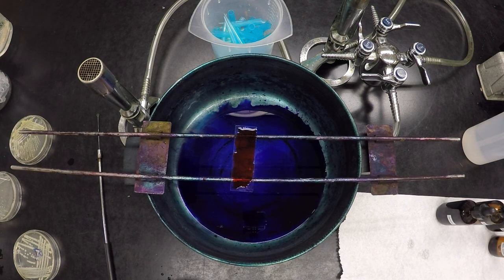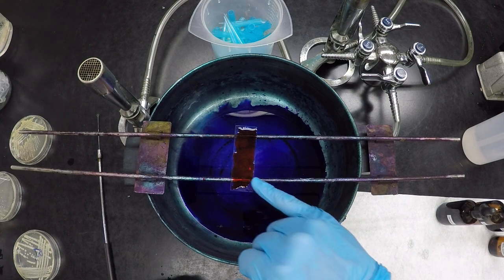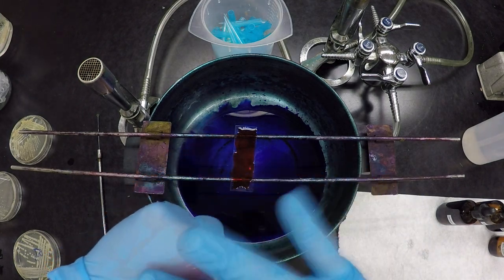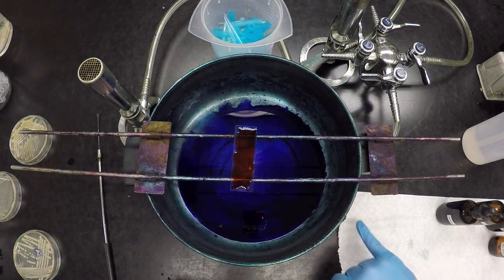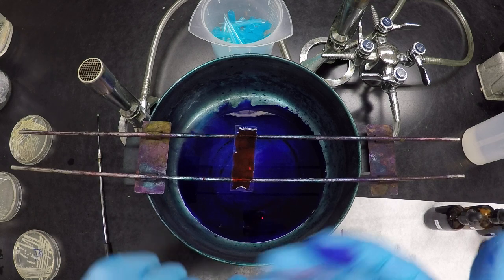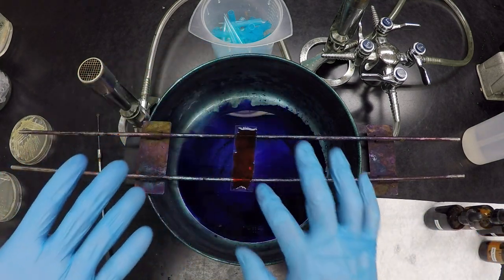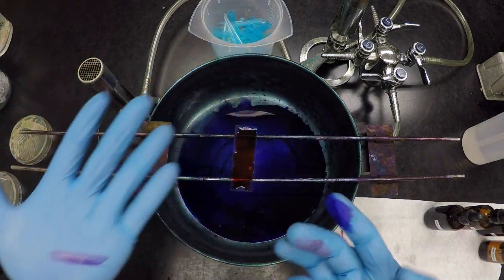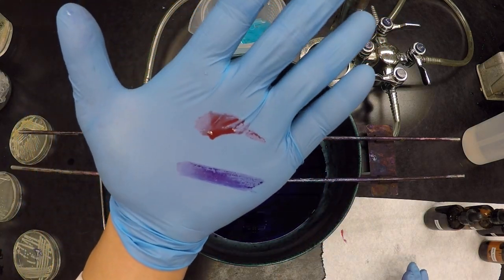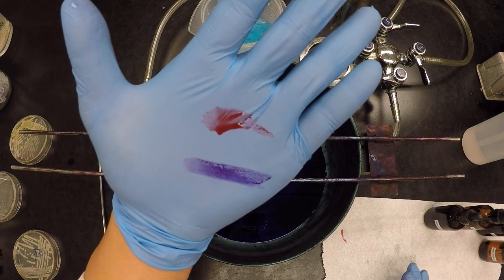It will color the gram-positive cells as well, but because the gram-positive cells have that very dark purple, you're not going to see the safranin. But our gram-negative cells have been decolorized. They're now going to end up in this nice pinkish red color. Do you want to see what that looks like? Oh, that's not showing up very well. There we go. That's the color of safranin. Oops, that's purple. There we go. So that's kind of what our two cells will look like: pinkish red versus a purple.